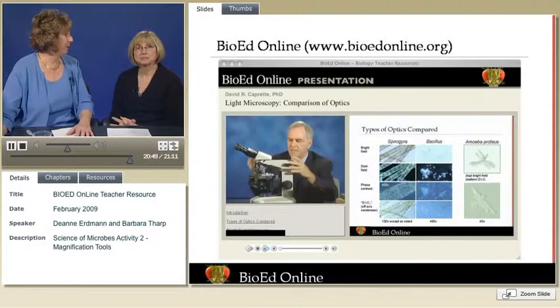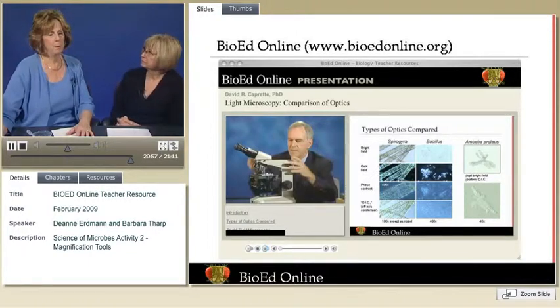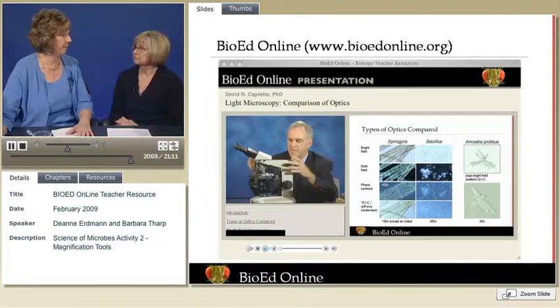The microscope is a really valuable tool in the classroom, and I think sometimes we can get carried away with technology and fancy equipment, but don't overlook that microscope. And if you'd like to learn more advanced techniques on good microscopy, we have a number of presentations on BioEd Online, and those are listed for you on the slide.